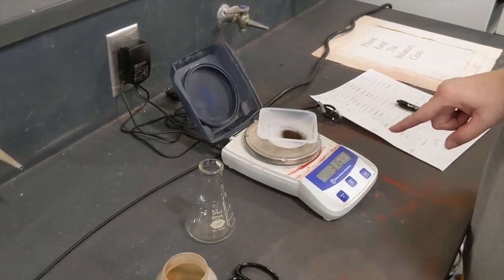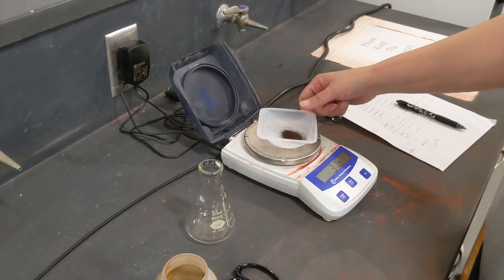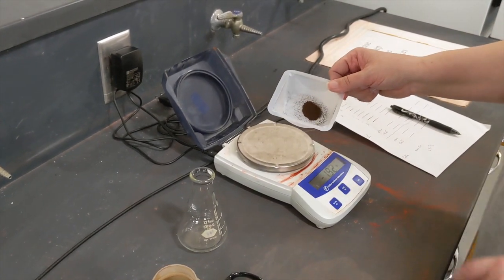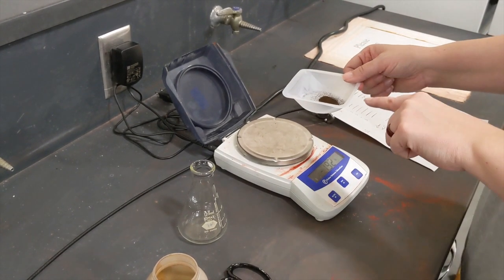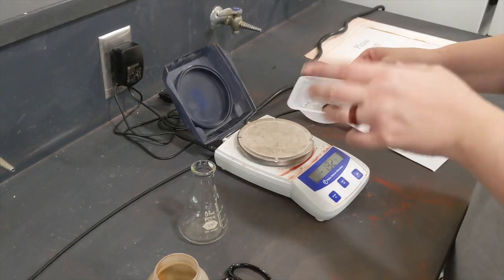Now I'm not writing this number down because here's the thing. This powder is pretty fine and when I transfer it into the Erlenmeyer flask, a little is going to be left behind. I don't want to know how much is in this dish. I want to know how much is in the Erlenmeyer flask.